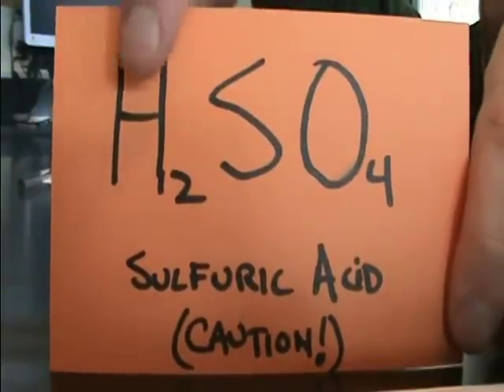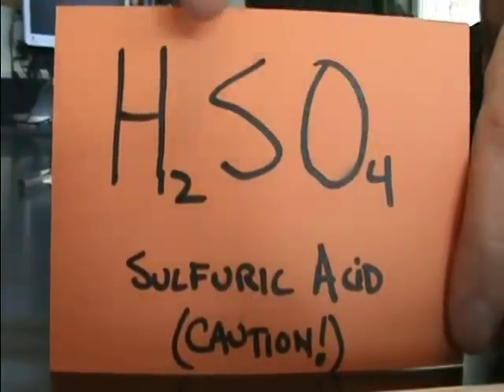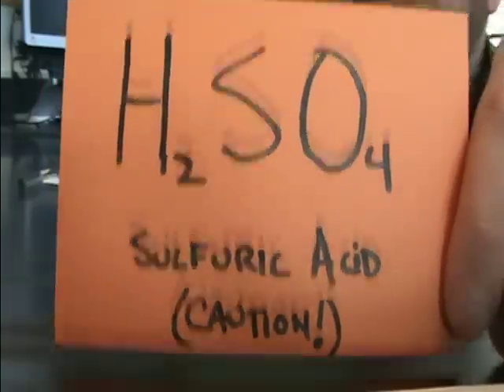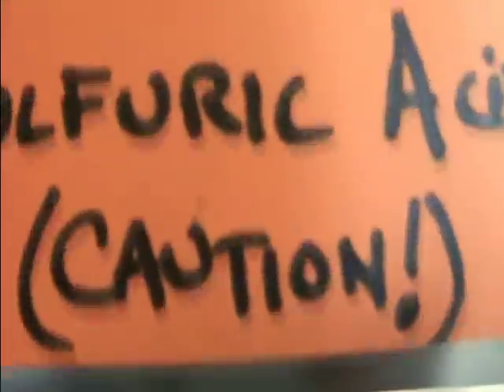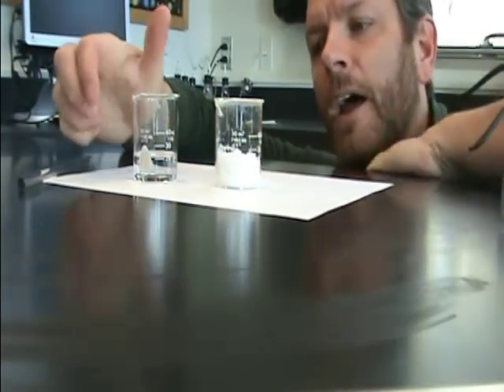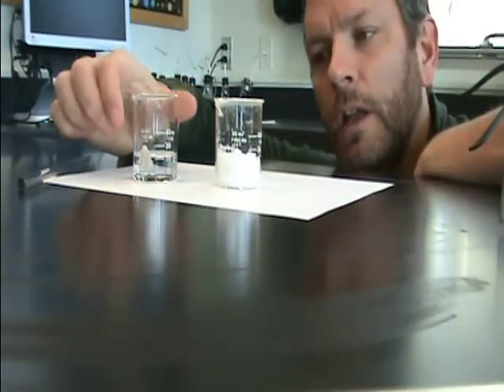Again, we have hydrogen and oxygen. This time we have some sulfur in there, and I will be using caution. It is fairly dangerous — there's a very concentrated acid right here.